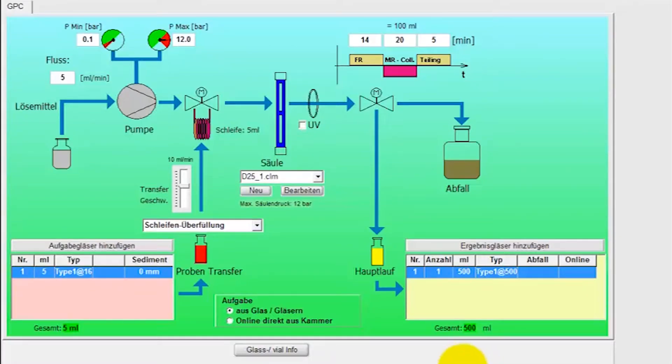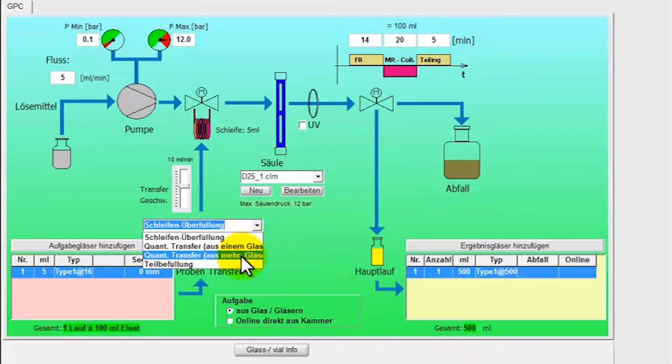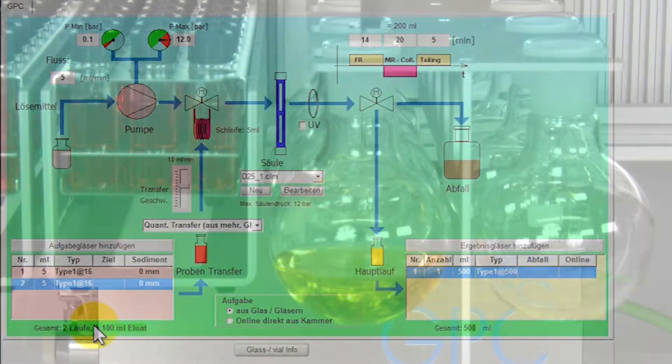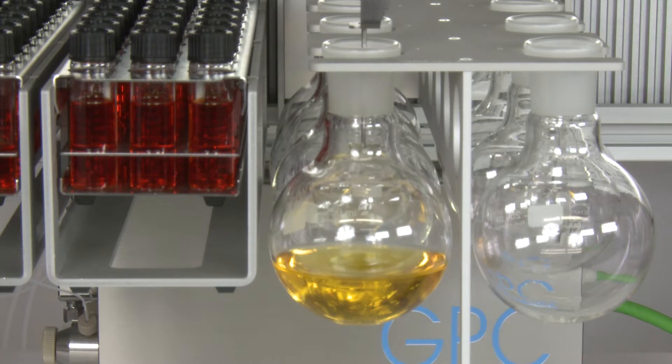Several injection procedures are available. With these, as is customary for example in dioxin analysis, multiple injections and quantitative transfer of a sample can be performed and then collected in a glass flask.